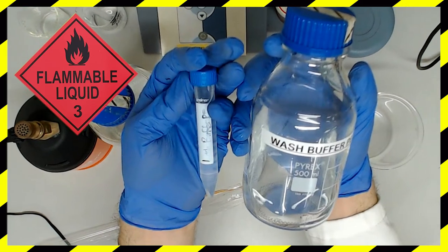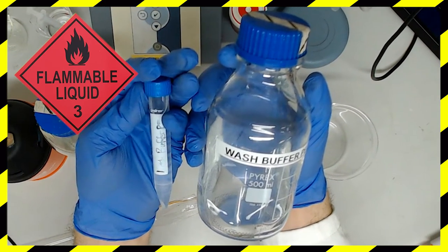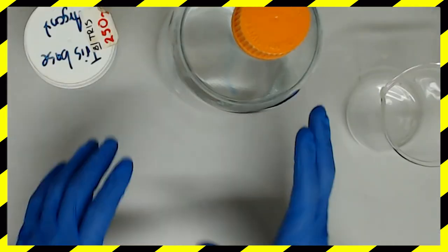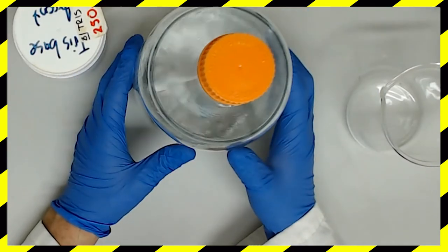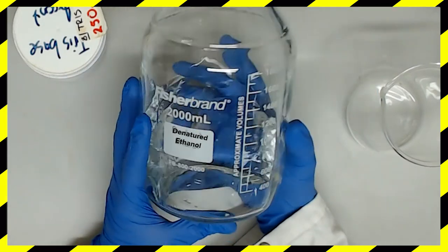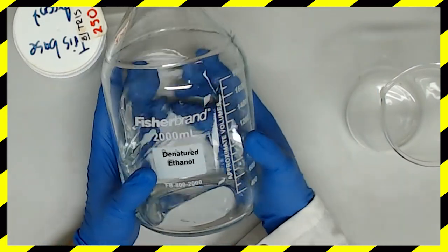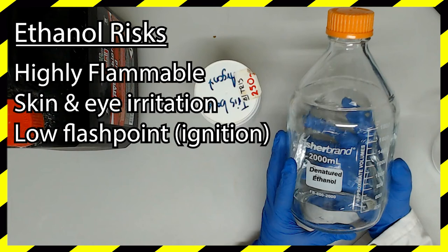The rest of buffer PE is almost entirely ethanol, another flammable compound that must never be autoclaved. Once diluted to 70%, ethanol is barely irritating to your skin, but in its concentrated form it can be painful, especially if it gets in your eyes. The real risk to mitigate with ethanol is the chance of it reaching its flash point, so be sure to handle it in a well ventilated area that's cool and away from open flames.